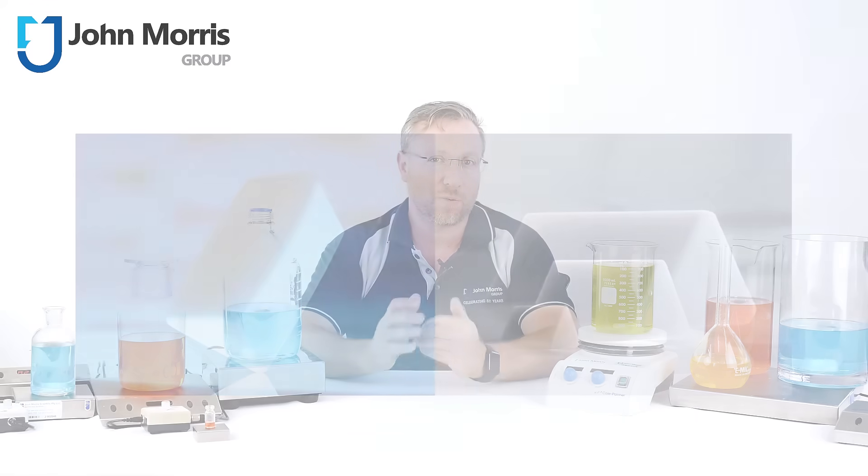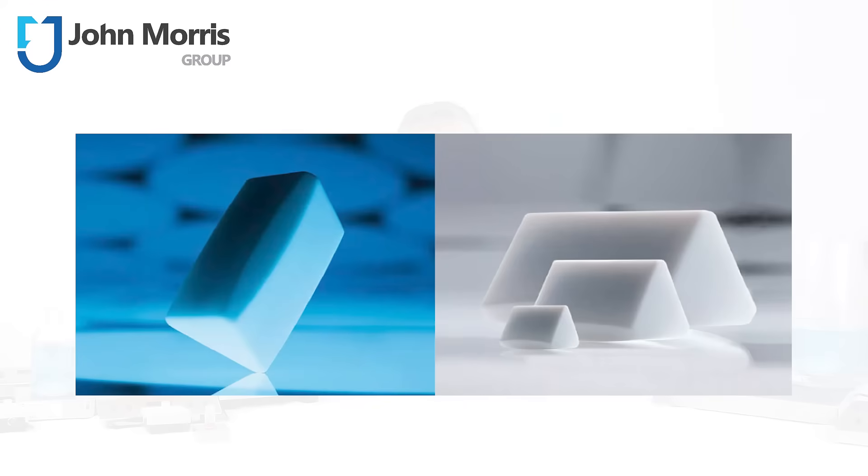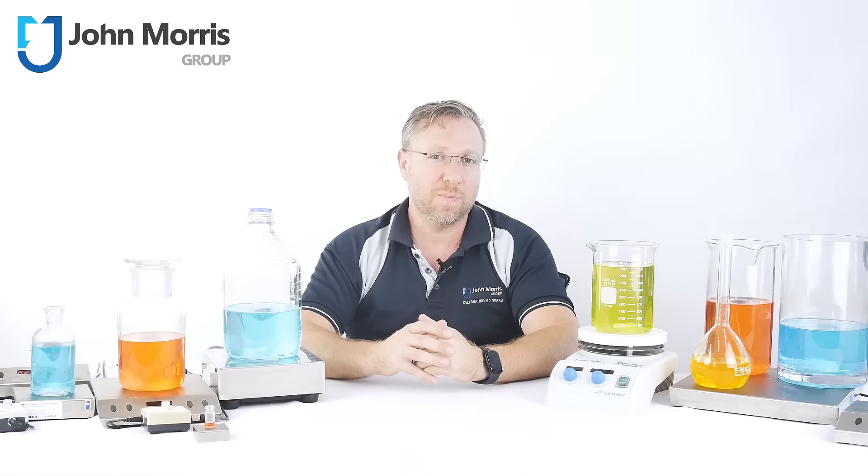2MAG also provide a range of premium samarium cobalt magnet fleas, which are perfect for when you need the best quality coupling.